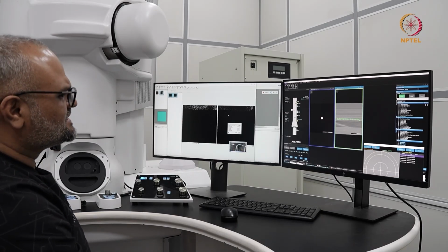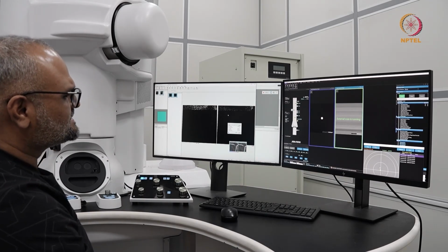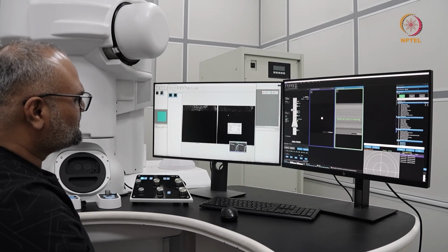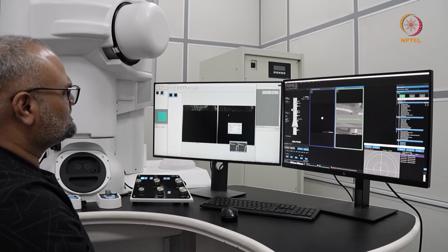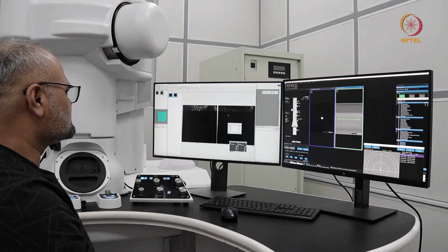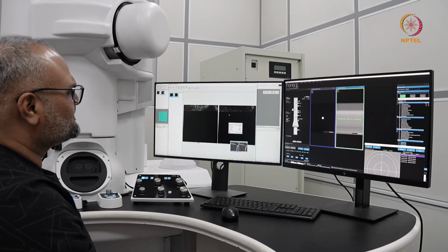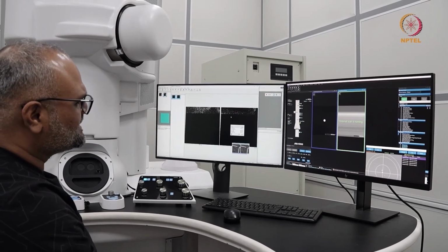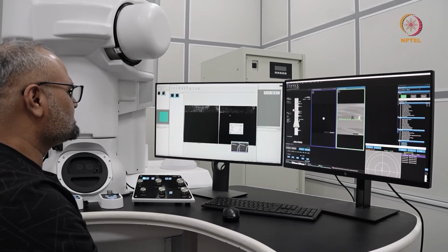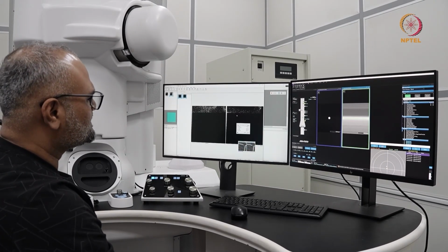It varies from case to case, from one specimen to another specimen. There are multiple factors that you need to be careful of. One is the takeoff angle, the kind of detectors you have, the collection efficiency, the thickness of the specimen, the spot size, the apertures, if you're using the right combination. You should have enough signal such that you get meaningful information from the sample, but also you shouldn't cause damage to the specimen. So it is a trade-off among multiple factors in order to ensure you get a good EDS map.